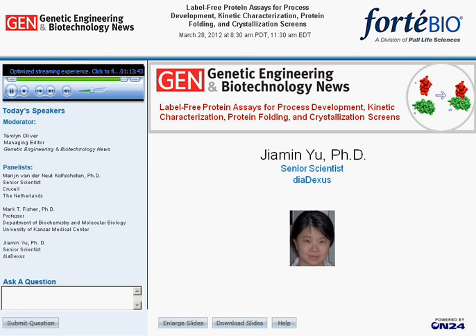Yeah. Wonderful. Thanks, Jim. Can I actually also address that regeneration aspect? This is Mark Fisher. We've also found that we could reuse chaperone tips very easily because you can reverse the binding affinity by adding osmolyte ATP mixes, and then you can regenerate the tip with the chaperone on there.